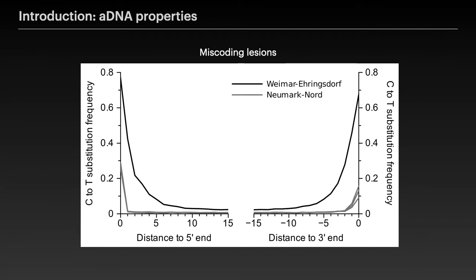This can optionally be eliminated by chemical treatment in ancient DNA extracts, so that removes the uracils and prevents this problem. But researchers often prefer to retain them, because they also act as an authenticating indicator for the presence of ancient DNA in their sample.